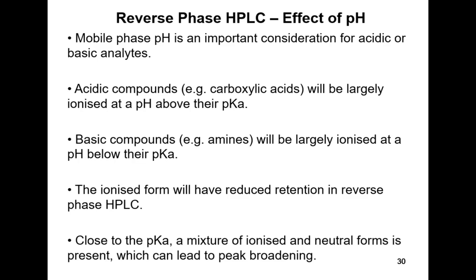So very early on in my career, when I think it was the first time I was really working with HPLC, I was trying to take a natural product, antibiotic, and modify it to attach amine groups. In fact, I want to get back to doing this maybe in some of my MSc projects. And just to give an illustration of the problems that we had.